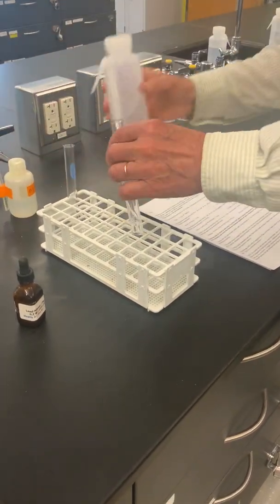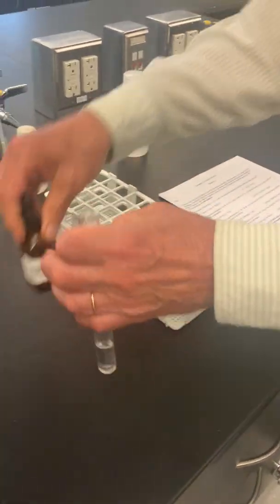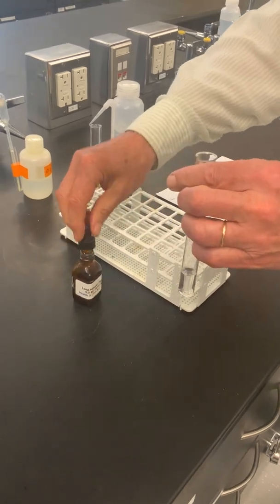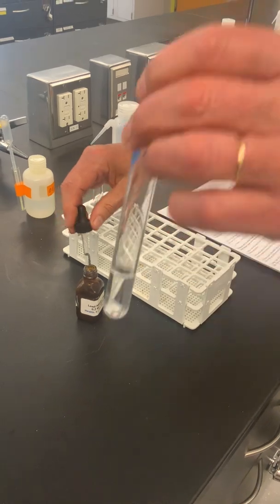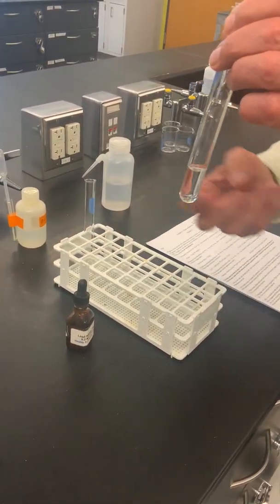I'll just add a little bit of deionized water to increase the amount. Deionized water, of course, is not going to have any effect on the chemical reaction. Here then comes the aqueous sodium iodide.